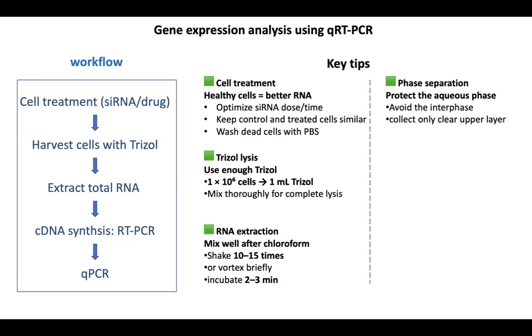For reverse transcription, select primers based on your experiment. Use oligo-dT primers, random hexamers, or a combination of both. To choose the right RT primers, you need to know whether the RNA of interest has a poly-A tail. If you are unsure, use a combination of oligo-dT and random hexamers.